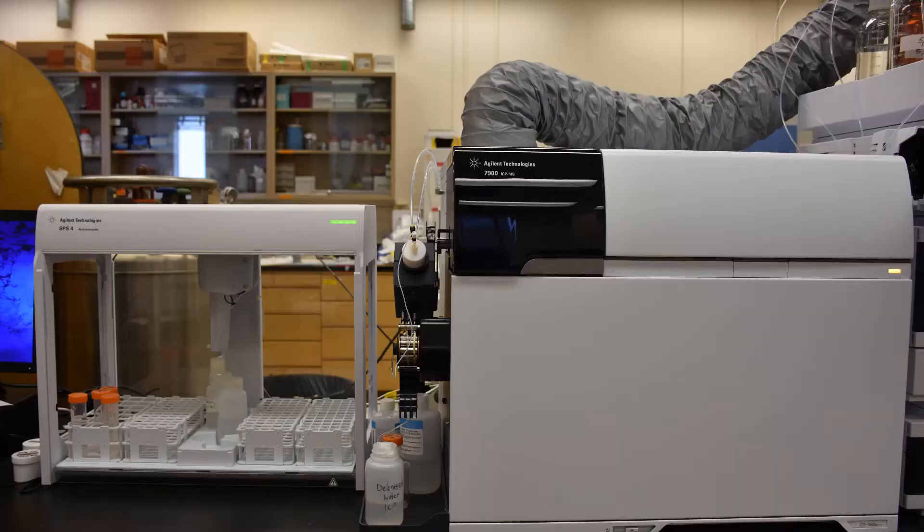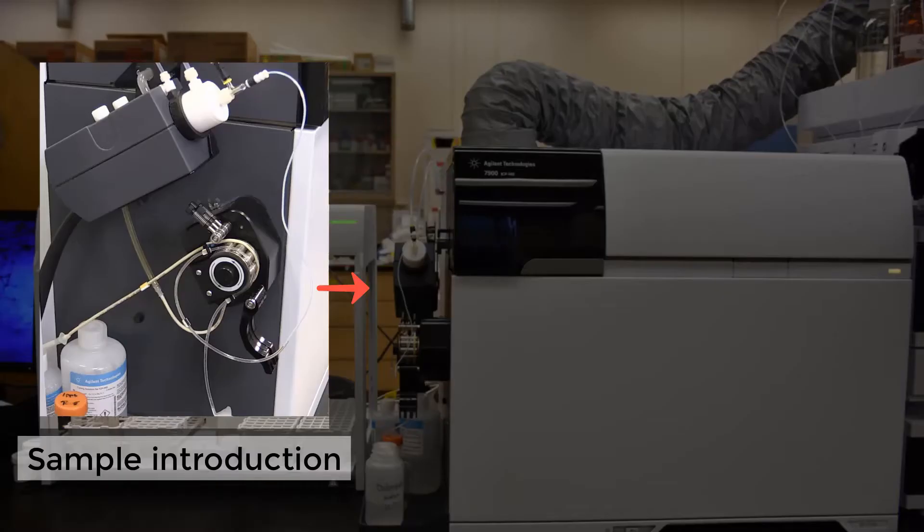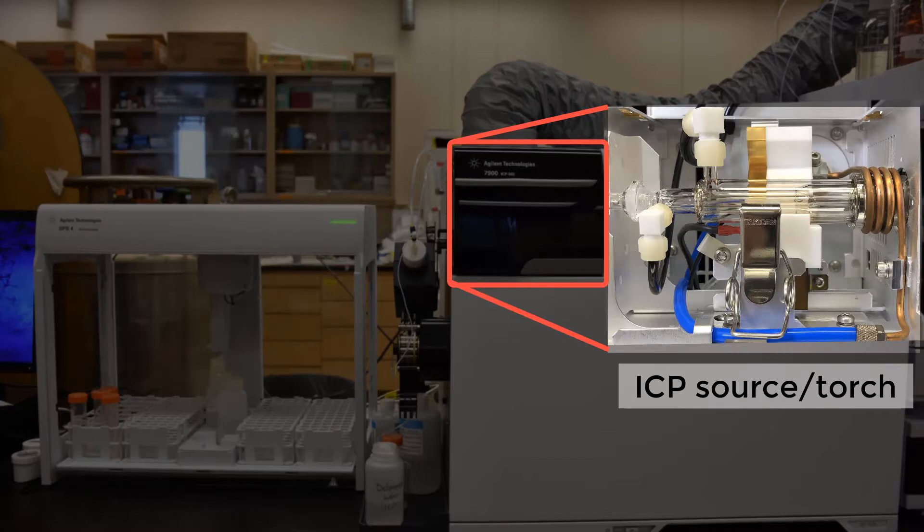An ICP has two major components: one, sample introduction; two, ICP source.